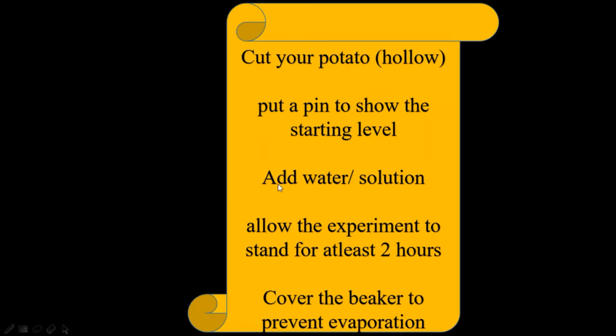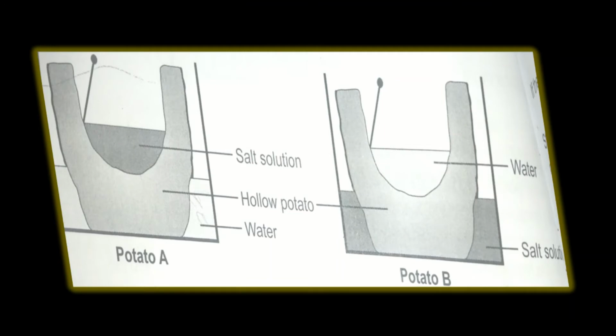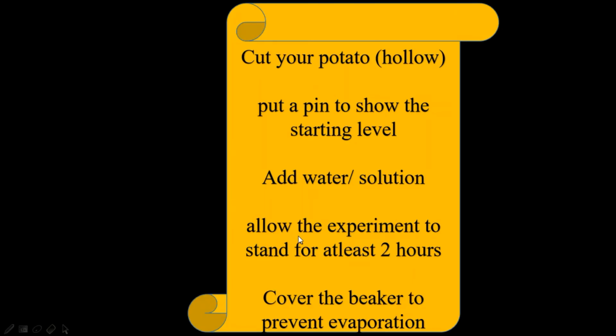And then from there you are either adding water or a solution. So you are adding water to your potato, and then you add a solution to your beaker, whereas in the second case you are adding a salt solution to your potato, and you add pure water to your beaker. And then from there you allow the experiment to stand for at least 2 hours, which is the minimum. We can go above 2 hours.